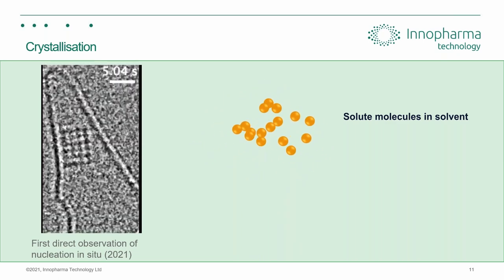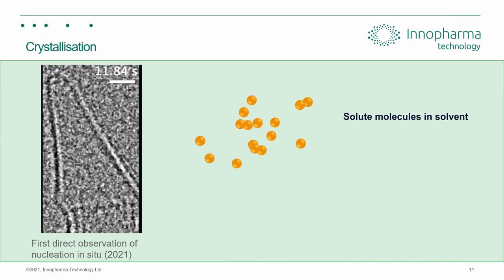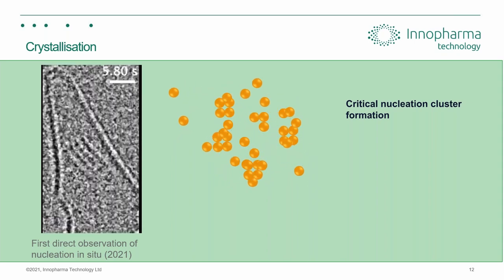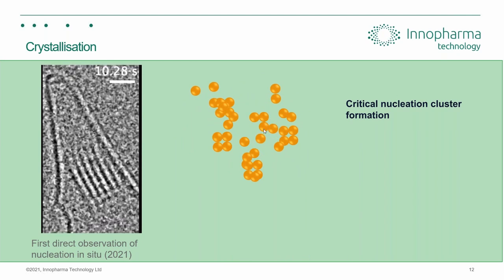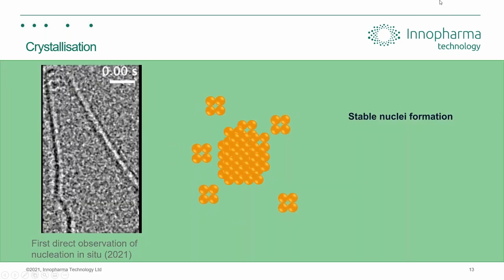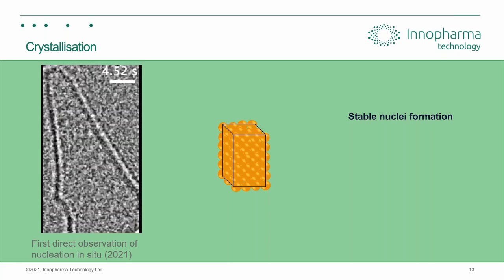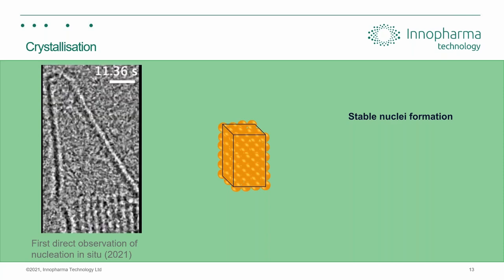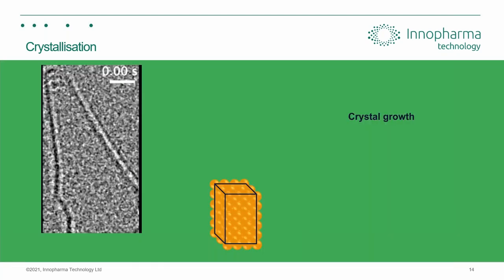Here they've captured video footage of nucleation happening, and you can see crystals forming. These are crystals of salt, NaCl, sodium chloride. So what happens is, clusters develop together, they form a critical size, a critical mass, and once they reach a critical mass, nucleation happens. These clusters start arranging themselves into regular arrays, and they prefer to arrange themselves in a specific way, the arrangement of least energy, and from that, they form the first regular crystalline structures and grow from there.